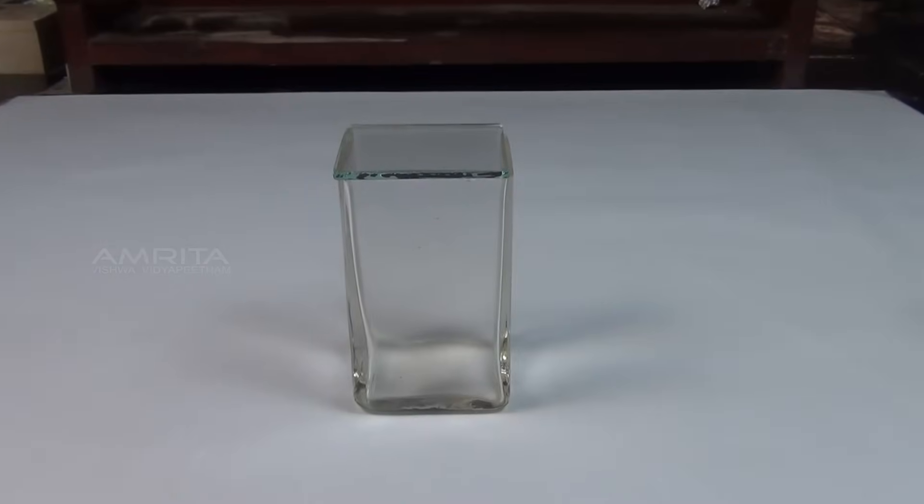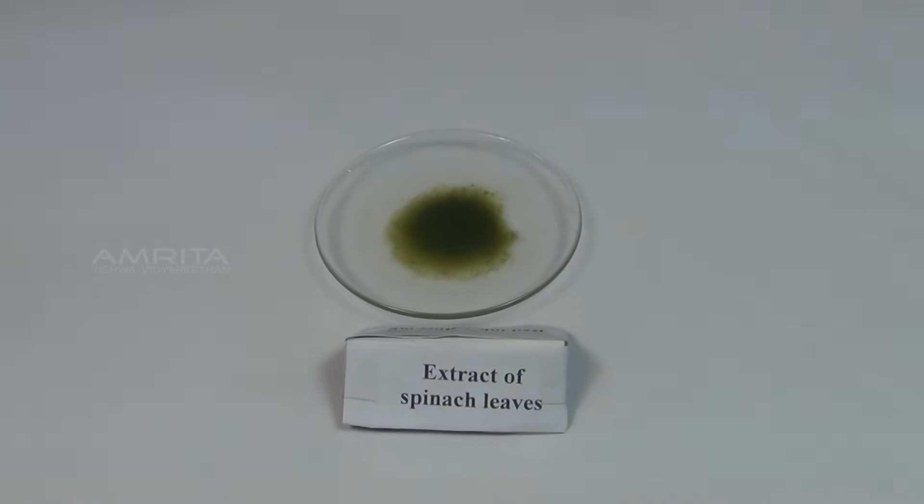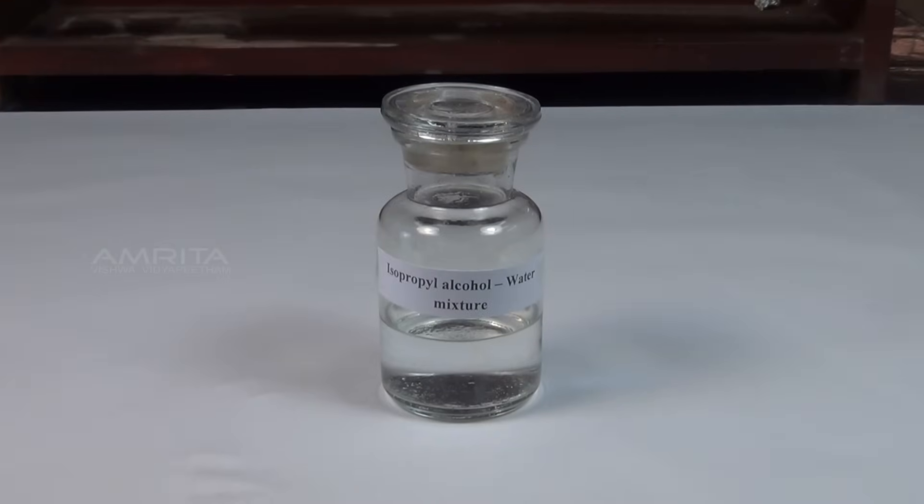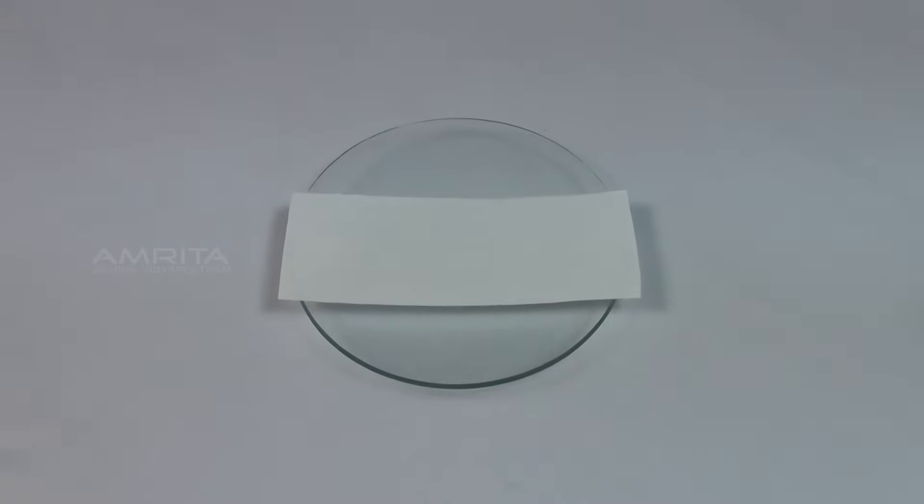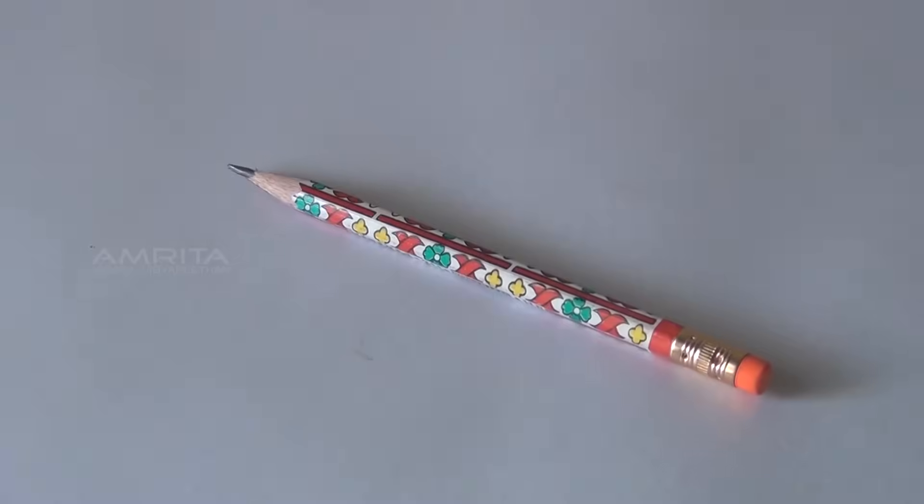Materials required: Chromatographic chamber with lid, extract of spinach leaves, isopropyl alcohol water mixture, Wattmann filter paper strip, fine capillary tube, thread, scale and a pencil.